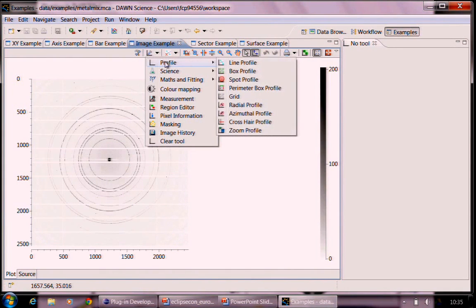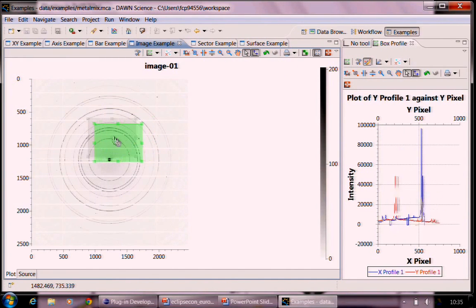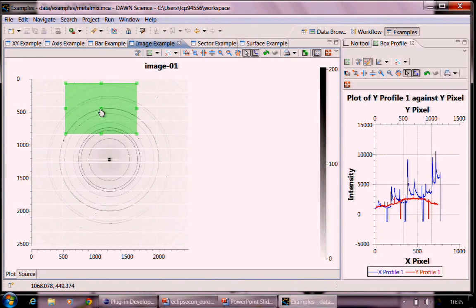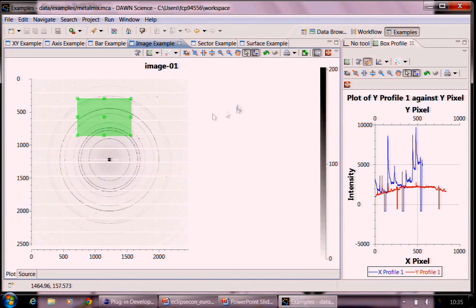So here's our image. And we spoke about tools earlier, and the tools work with regions, and regions are basically selectable areas of data, but as well as getting the bit of GUI to modify it, you also get a data layer object which describes precisely that data.